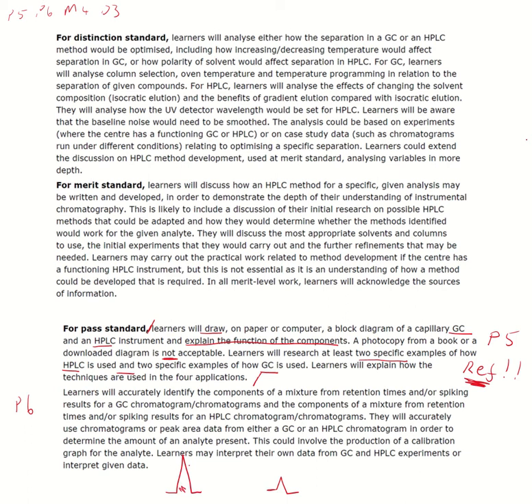You should know based on the theory that a computer would actually measure the area under these peaks to determine the relative abundance for one of them to another. But if you're not given that information on peak areas to do so, then it may just be a case of it could have just been simplified to looking at getting a ruler out and measuring peak height and doing a ratio comparison that way. So it's not strictly correct, but based on some assumptions about the shape and such, it's probably the best thing you can go with in a level 3 environment for working it out, as long as you're aware that in a workplace you would actually be looking at the area.